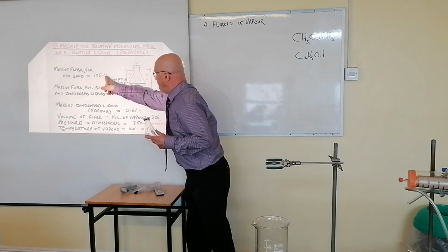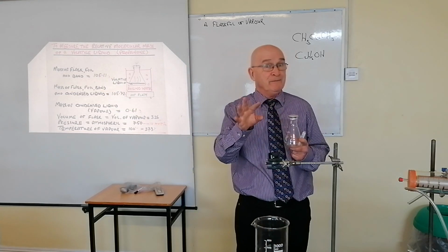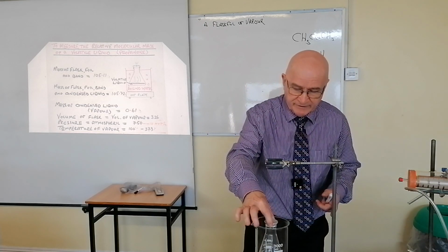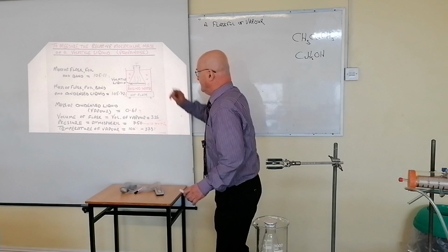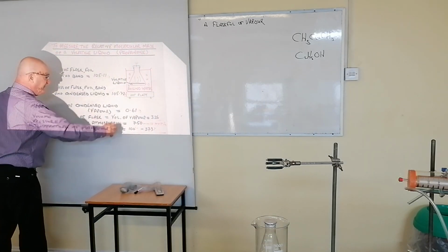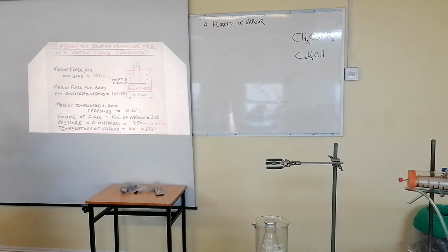Okay, the flask full of vapor, and it was that. And thankfully, it's bigger. Okay, now if you weren't attentive enough to that, you could lose some of the vapor, and you could find your mass was significantly incorrect. So be careful, won't you, with that as you walk through it, right? So that's that. And so by subtraction, in due course, you'll get the mass of the condensed liquid or vapor, and that's the difference in these two numbers. All right with that, everybody?